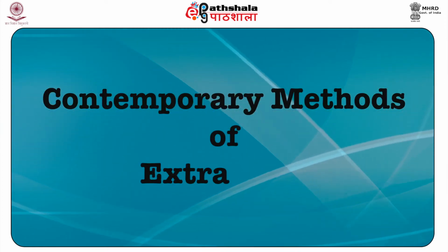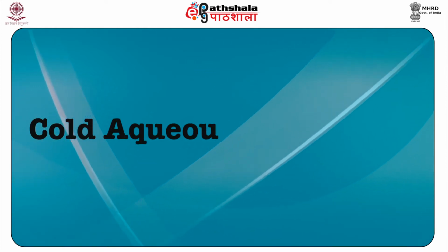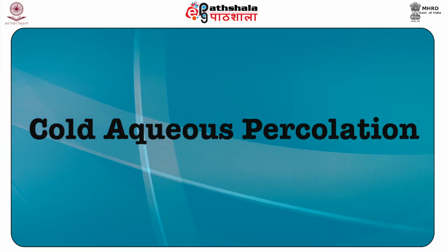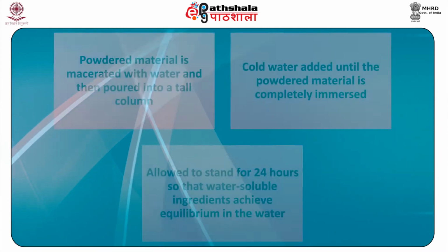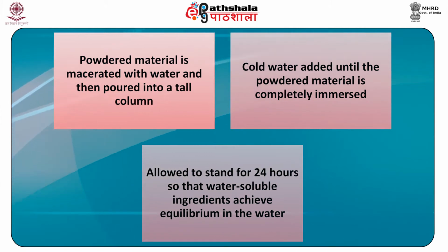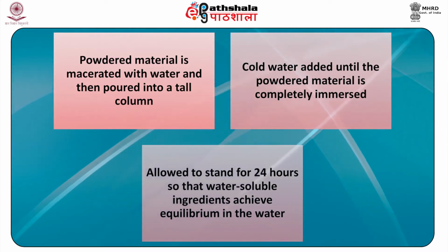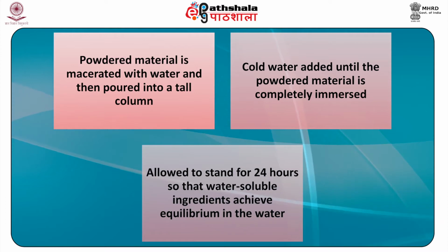Next, we will study the contemporary methods of extraction. Starting with the first, the cold aqueous percolation. The powdered material is macerated with water and then poured into a tall column. Cold water is added until the powdered material is completely immersed.